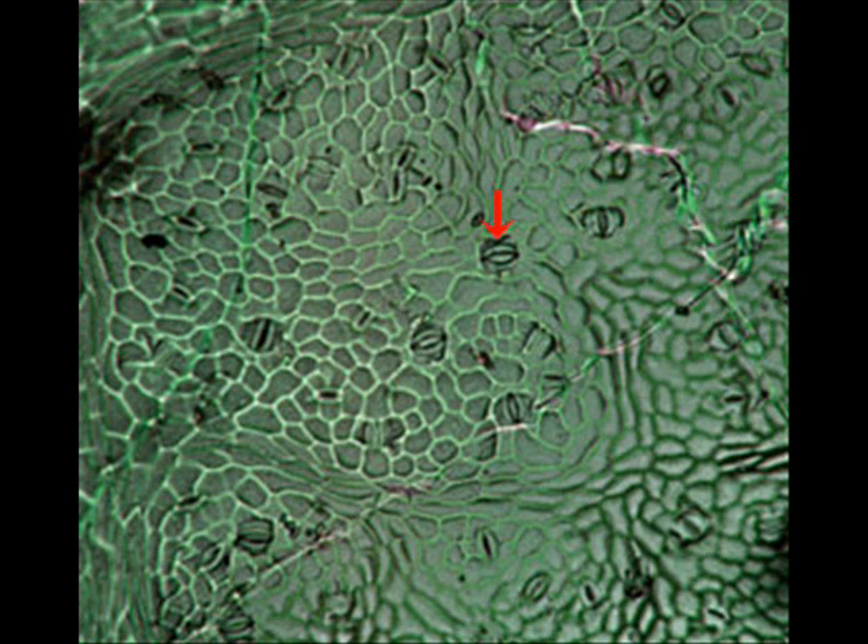This is the second sketch you'll need — the stomata on low power under a microscope. Low power is 10 times 10, so 100x. Note the red arrow; it points to a stomata. Can you tell if that stomata is open or closed? Make sure you're making a nice, detailed sketch of the stomata.